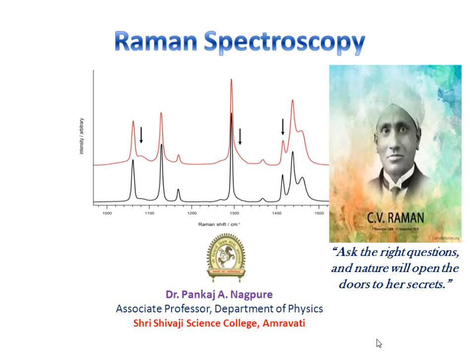In this lecture, I will discuss the principle of Raman effect and how it can be used in Raman spectroscopy to perform qualitative or quantitative analysis of a given sample. Let us first understand the Raman effect.